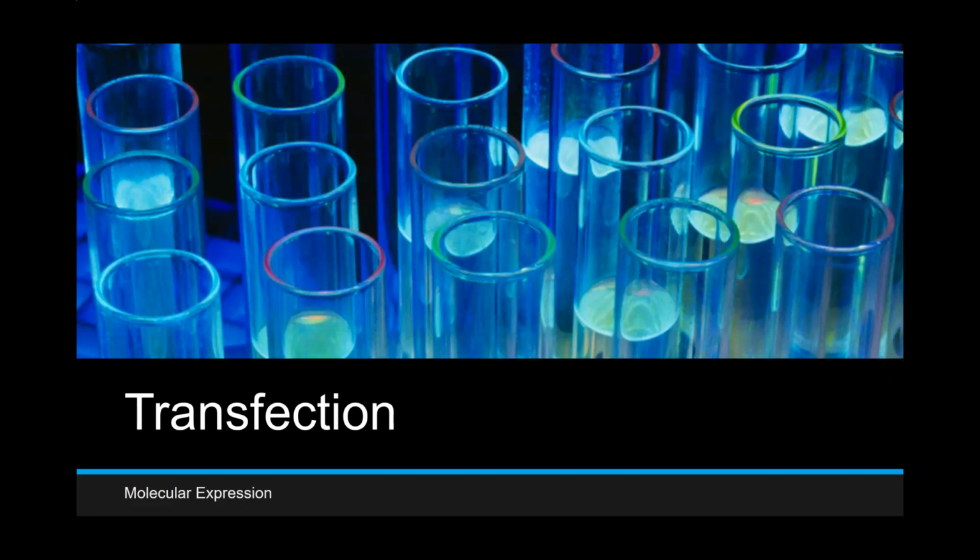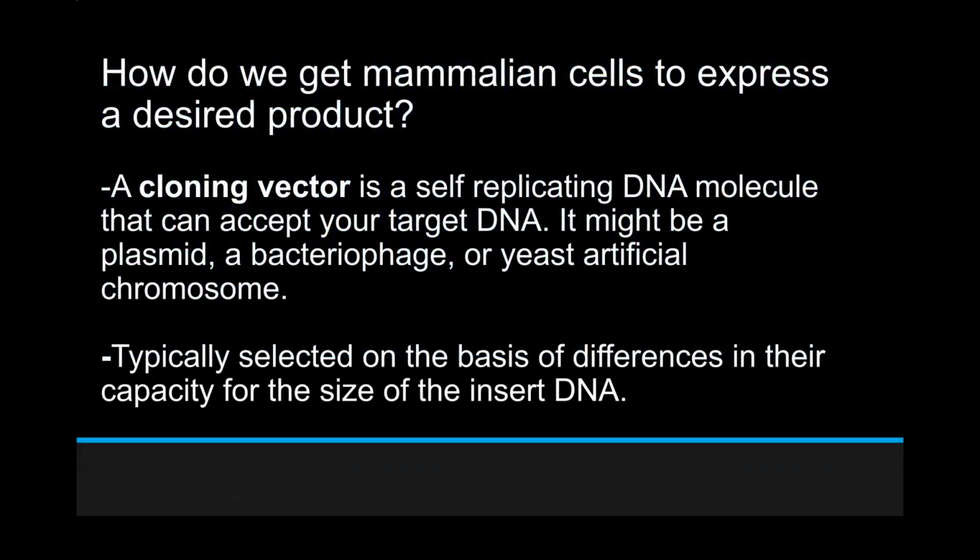This presentation will cover the most common methods of introducing foreign DNA into your cell culture. This process is typically transfection. This is the question that your experiment will demonstrate if it works perfectly. How do we get mammalian cells to express a desired product?